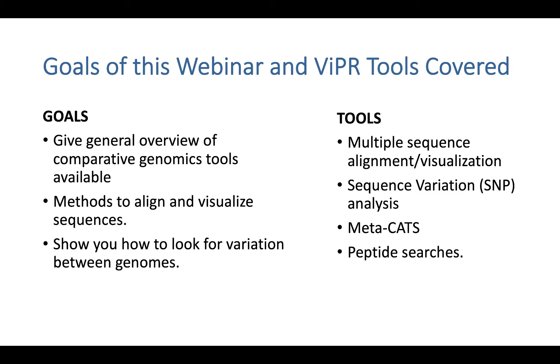The goals of this webinar are to give you a general overview of our available tools. I plan to show you how to run a basic multiple sequence alignment, visualize it using our MSA viewer, look for sequence variation using our traditional SNP analysis tool, use our metadata-driven comparative analysis tool called METACATS, and finally how to use our peptide motif search tool.